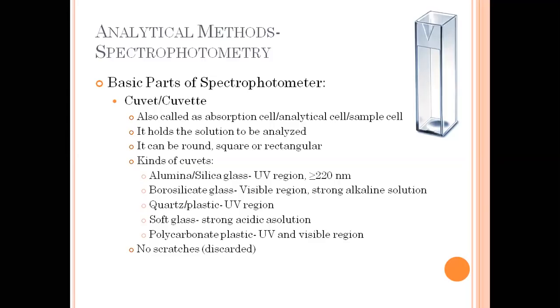So whenever we see scratches in our cuvettes, we can no longer use them because that could affect the result of the measurement. So you have to discard that. But in a real setting, here in our laboratory, we don't discard them. You can do that depending on the SOP of the hospital. But here with us, if I let you use a cuvette and you see that it has scratches or dirt that can't be removed, you will say, ma'am, I'll throw this away because it has a scratch. No, you can't. Okay? Because that's quite expensive.